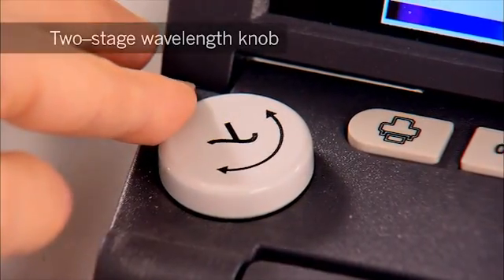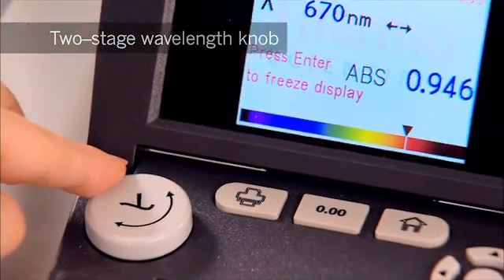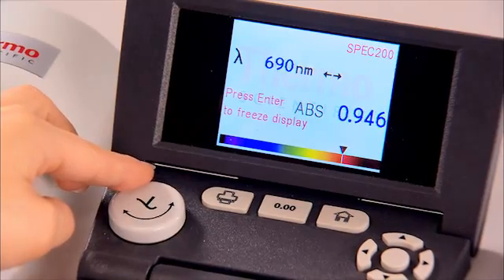The controls blend the modern and the familiar. The two-stage wavelength knob makes it particularly easy to set up the wavelength in an experiment. Modern live display mode shows wavelength and absorption.